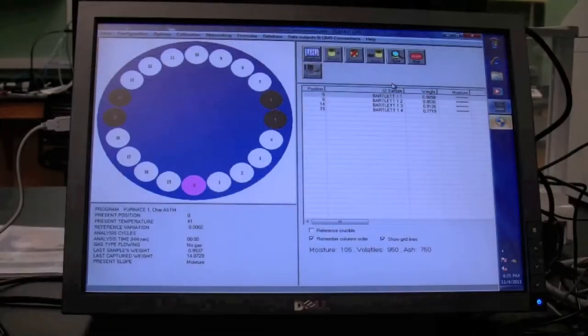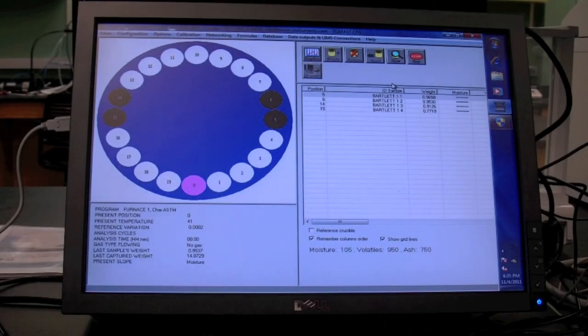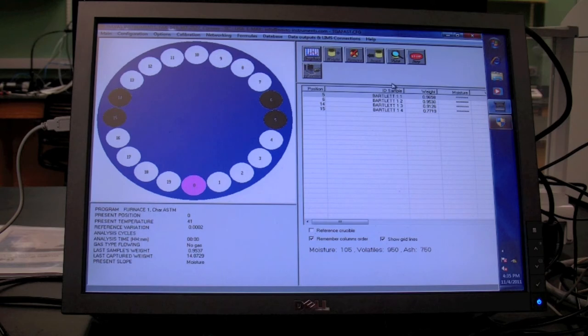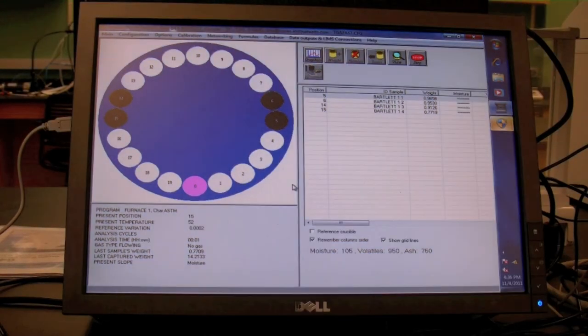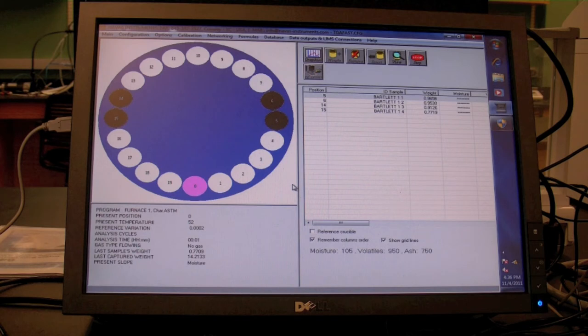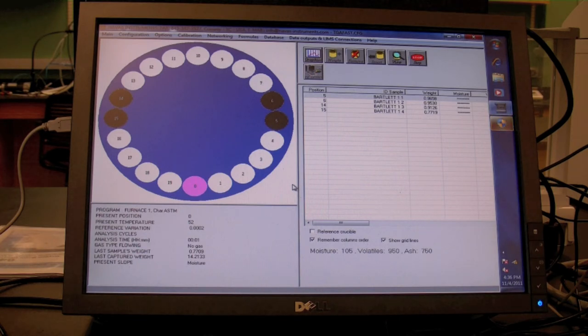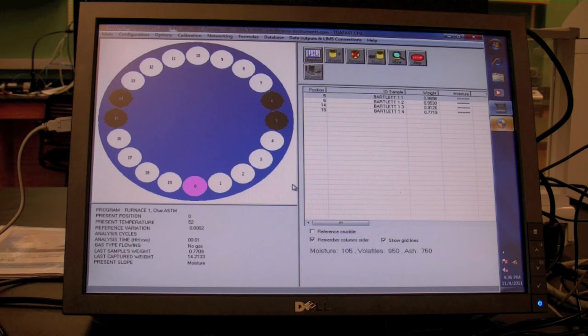It's analysis. If the analysis was successful, the computer will automatically print the data.